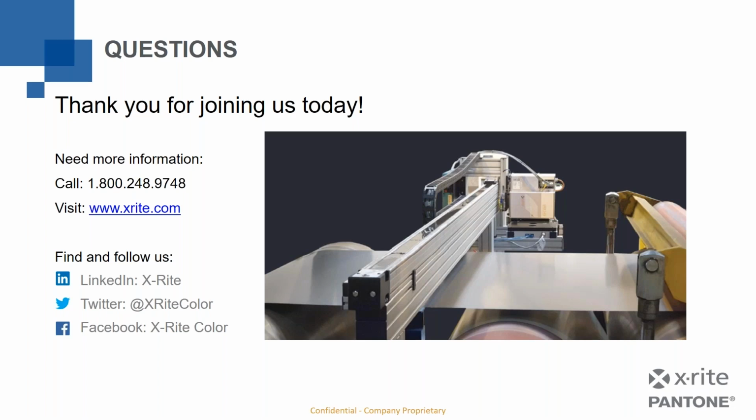Okay, I got one question here. Someone asked about extraneous light. It's always a question when we talk about non-contact color measurement, right? Does the extraneous or the ambient light have an issue when we have a non-contact measurement device? And the simple answer is no, right? The intensity of the light that we are using to illuminate the sample when we're taking the measurement is so significant that it essentially cancels out the impact of extraneous light.